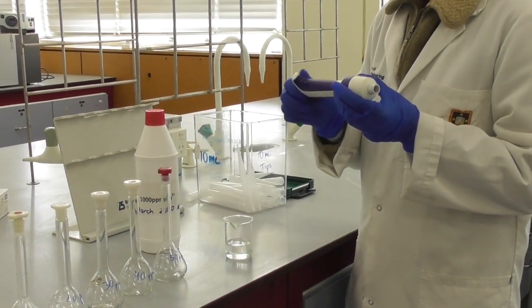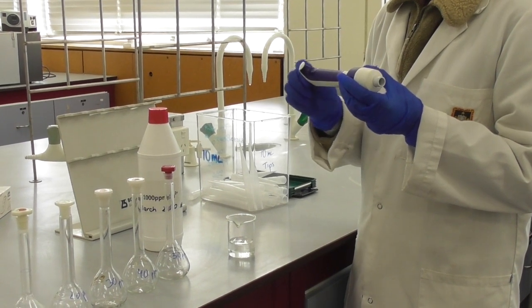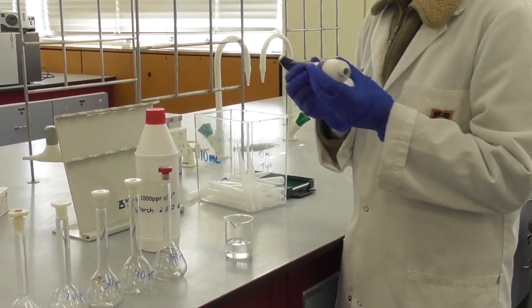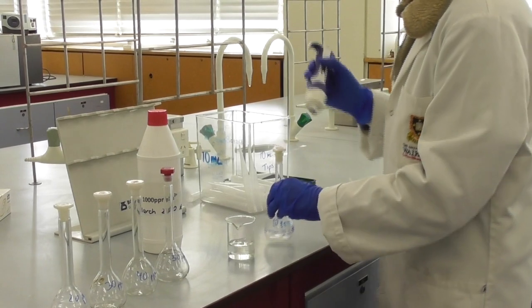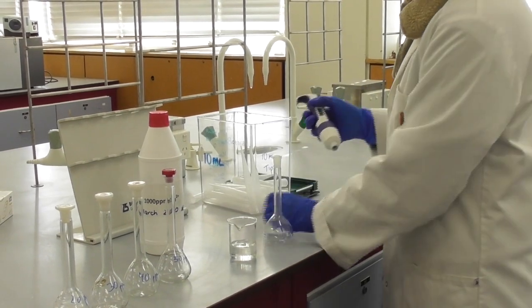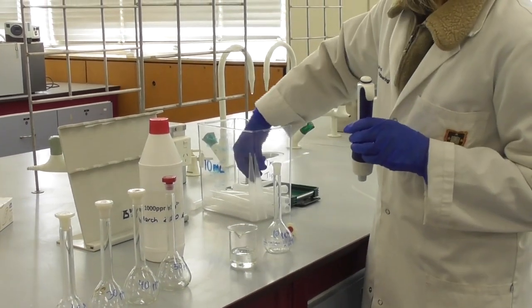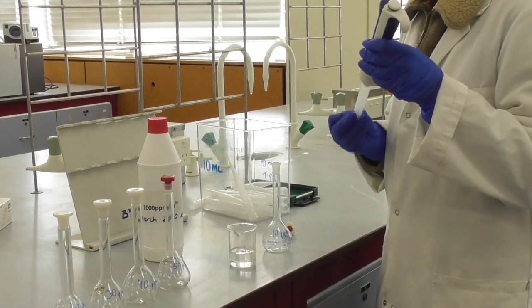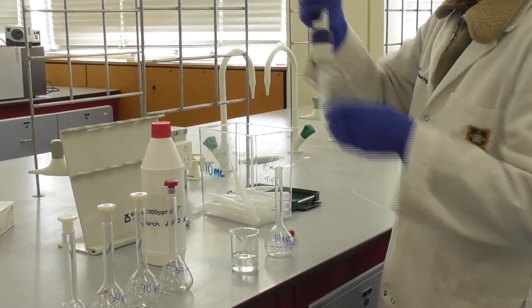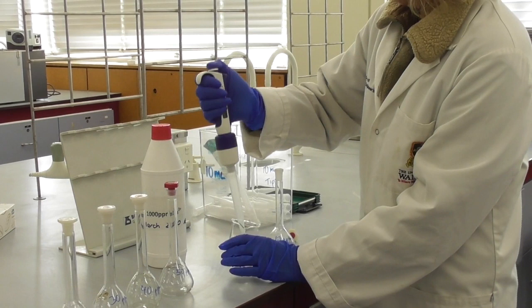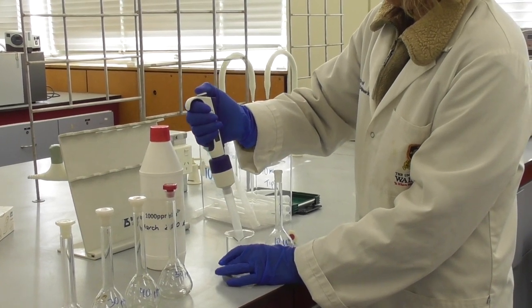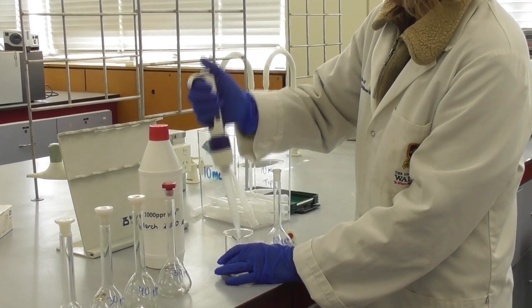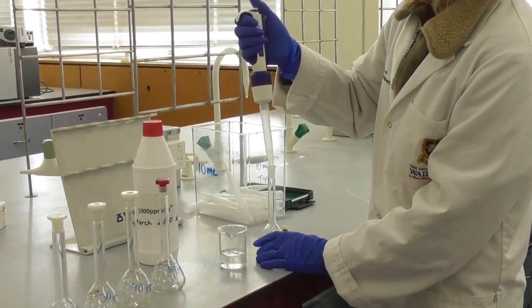I grab a micropipette and set this to the correct volume for my 10 ppm standard stock solution. I add a clean tip to my micropipette and then measure out the 1000 ppm stock into my volumetric flask.